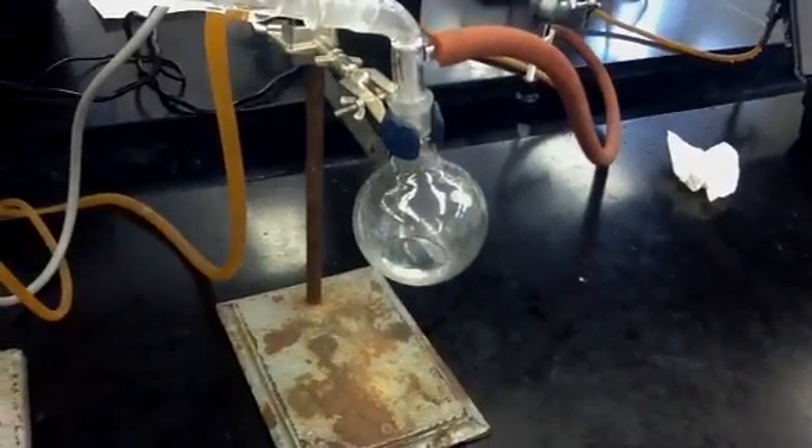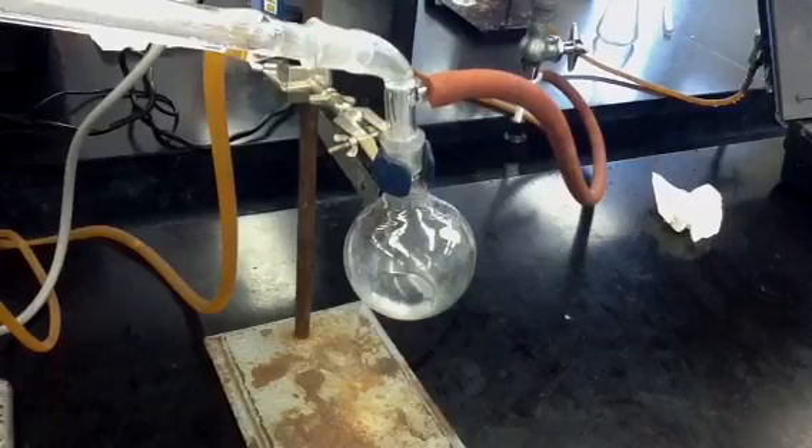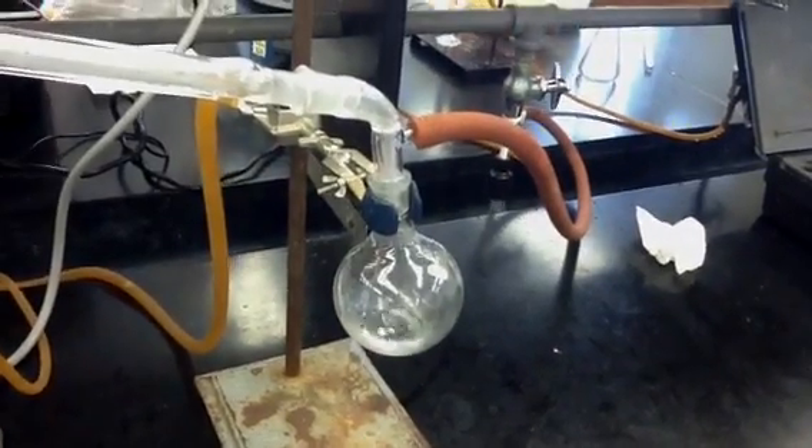One thing I forgot to mention is when you turn the aspirator on, make sure to turn the water on all the way to create maximum vacuum, because otherwise the experiment will take way too long to get done.